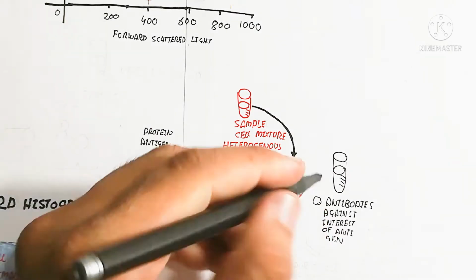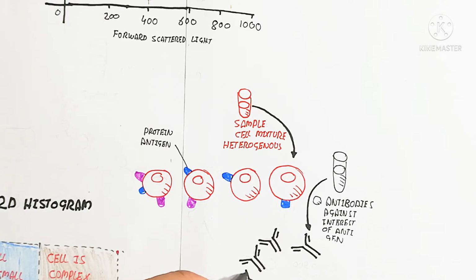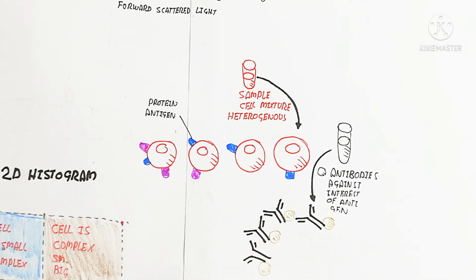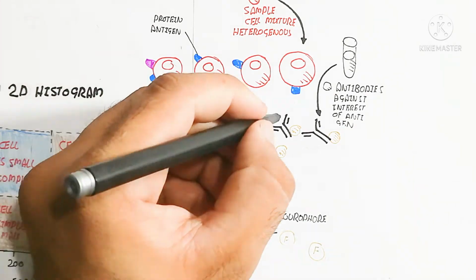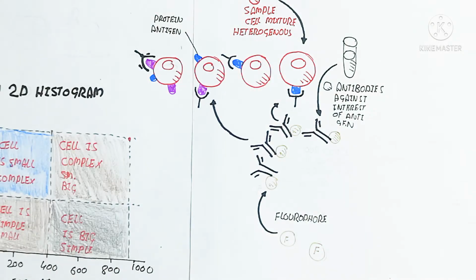So here, the antibodies are directed against the antigen of interest. So we are preparing to understand what is against the antigen. It means we understand that the antigen is present in that cell, and we have these antibodies, which you can buy from the market, so that we can attach the fluorophore in the lab to detect it.